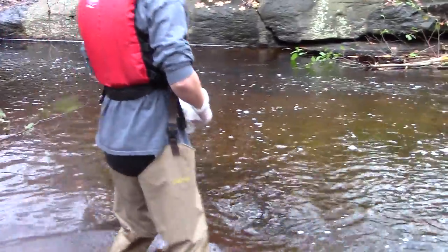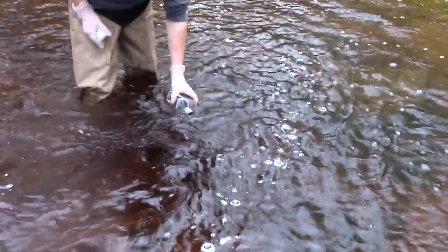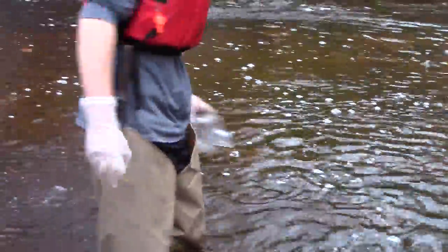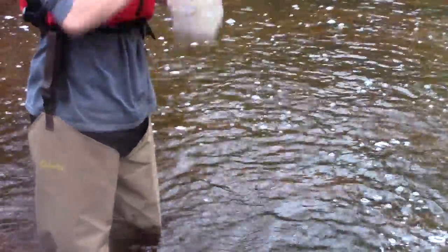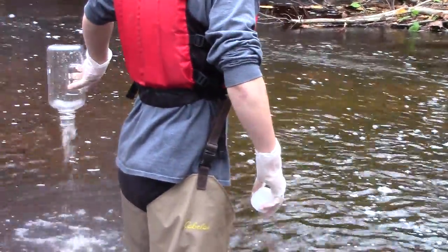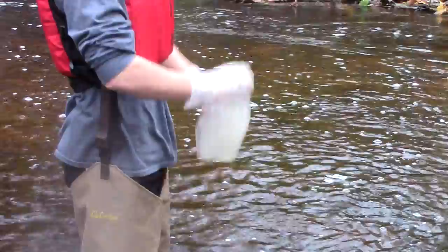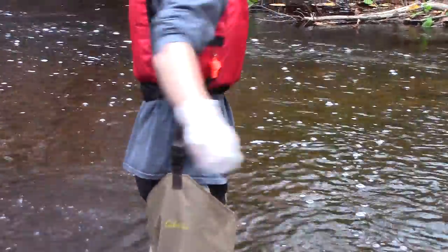Clean Hands takes the bottle to the sample site. Once in place, Clean Hands unscrews the bottle cap and rinses the bottle and cap three times, filling from one side of your body upstream and emptying on the other side of the body downstream. If you are sampling from a boat, fill the bottle with rinse water on one side of the boat and empty the rinse water on the other side. Clean Hands only needs a little bit of water for this; it does not need to fill and empty the bottle three times.